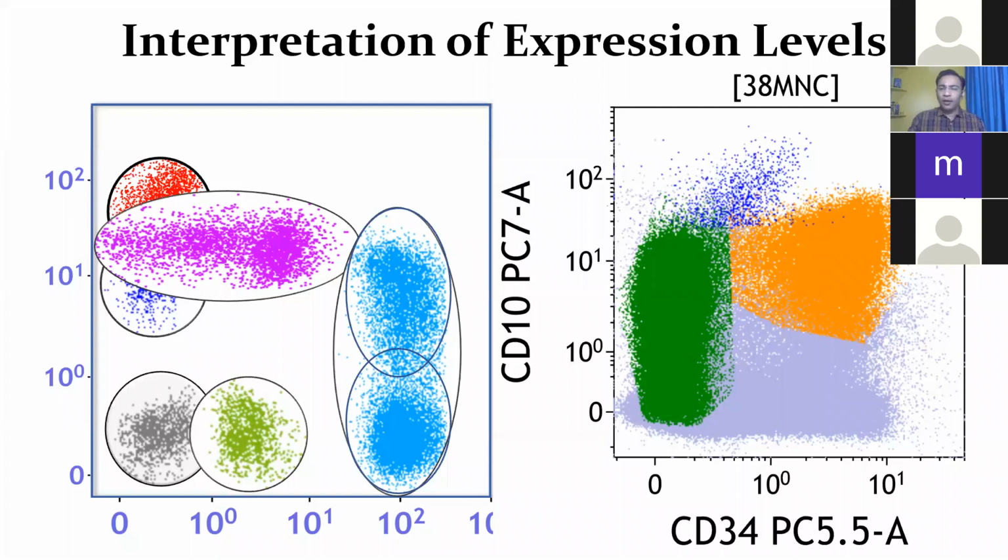I hope this is perfect. As you're on the same slide, another participant has asked if you can do the same for partial also. Okay, sure. So I'll go back. So this is partial.